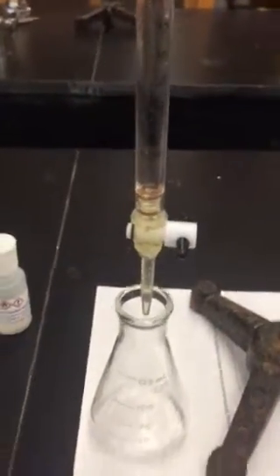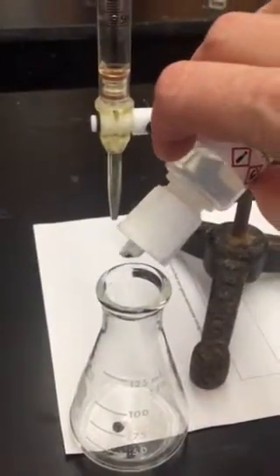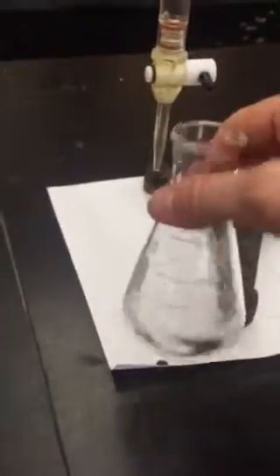Turn it off. Now make sure that you add the phenolphthalein. If you don't add the phenolphthalein, of course, you're never going to have a color change. Go ahead and put a drop — only takes a drop or two — into your acid, and of course, that's going to be colorless because you have an acid.